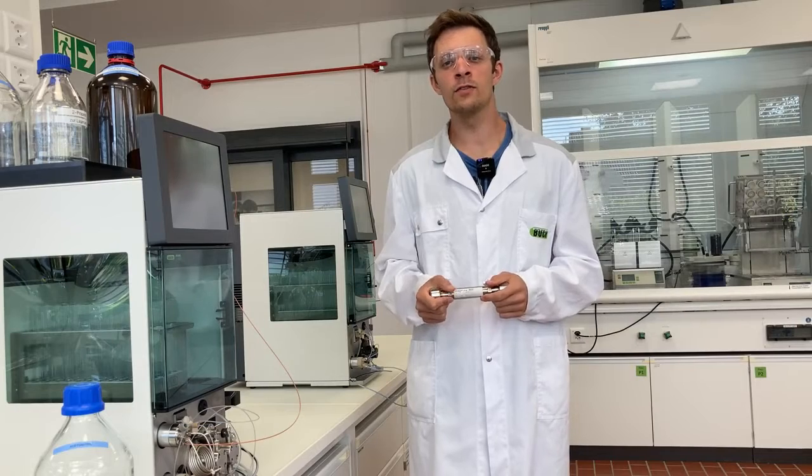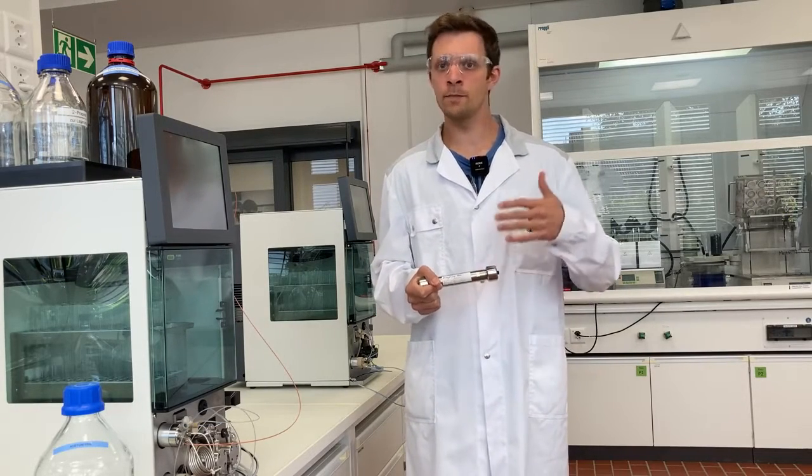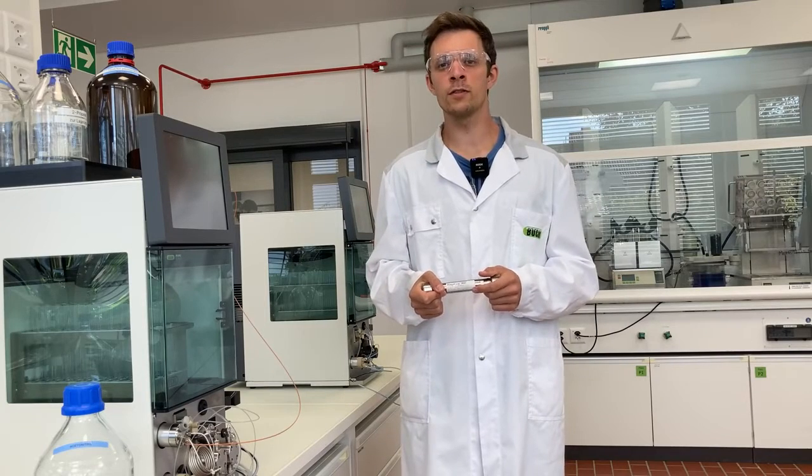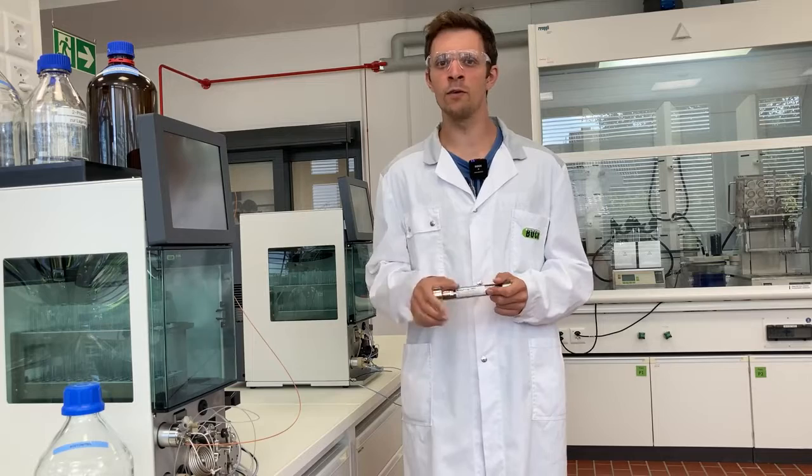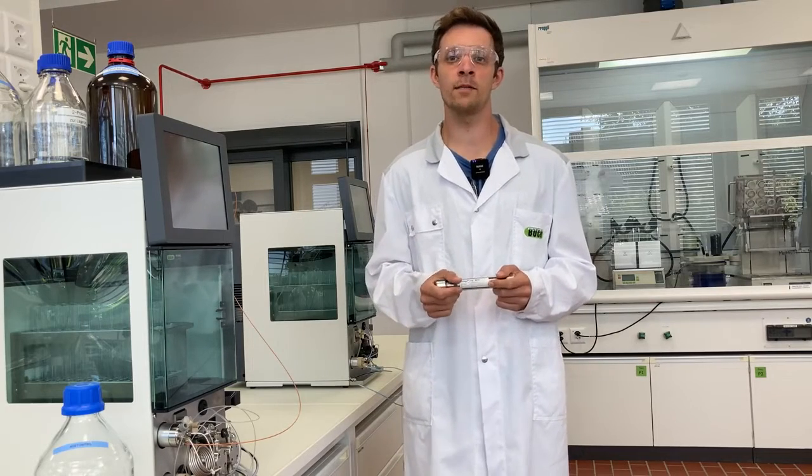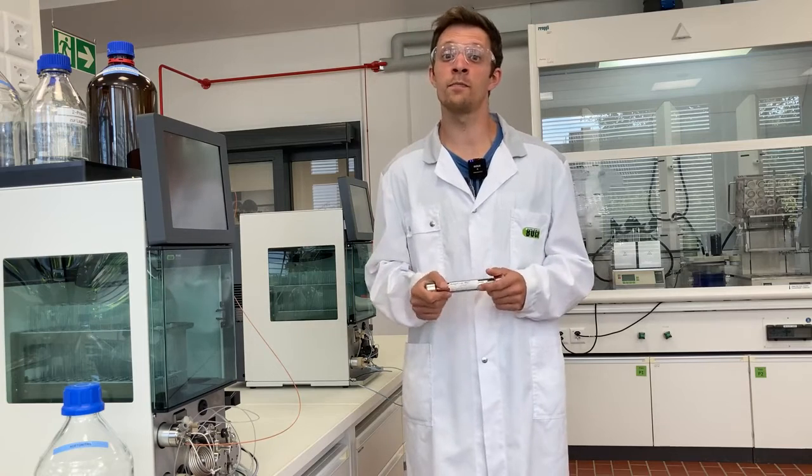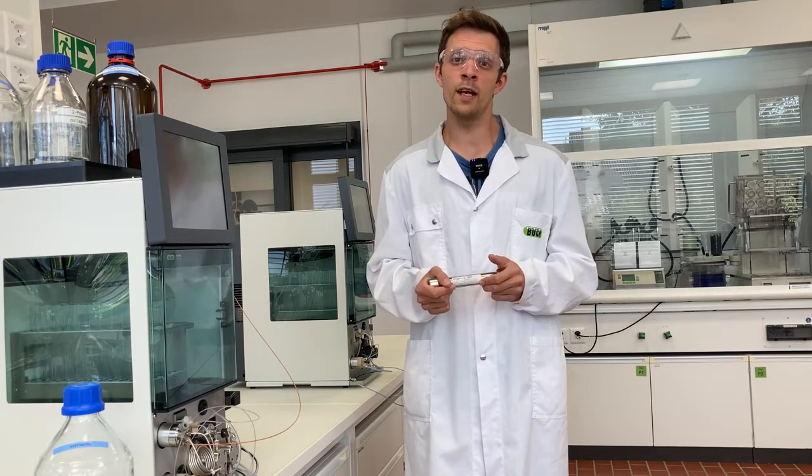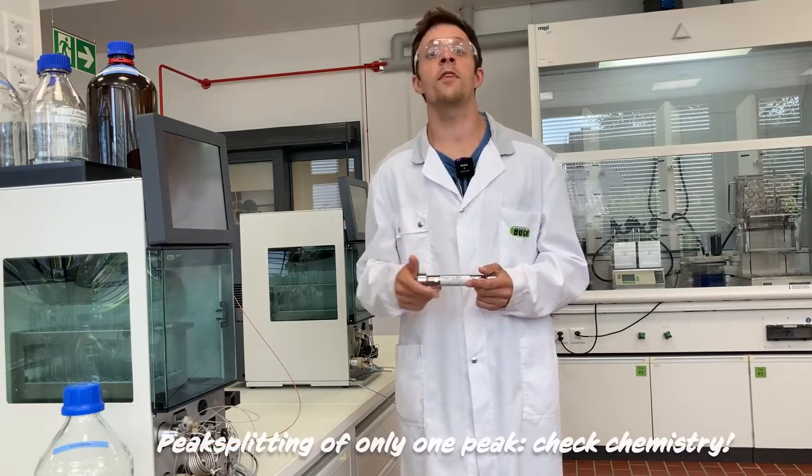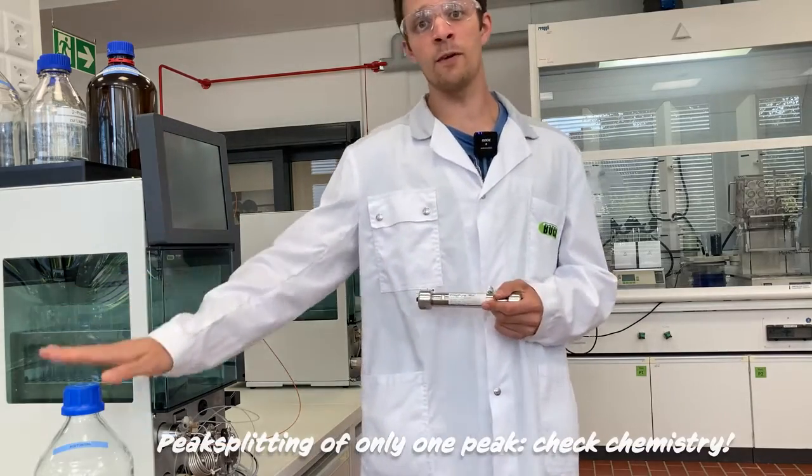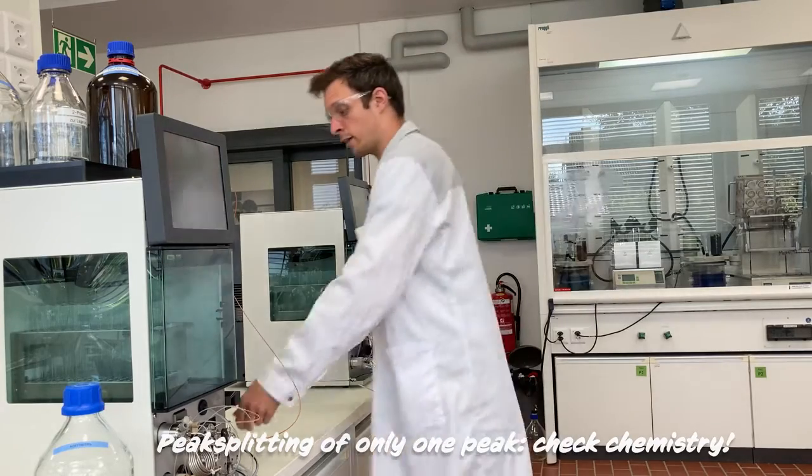Finally, I will go into more detail about peak splitting. If peak splitting occurs, it's important to check if only one peak is affected by peak splitting or if all peaks are affected. If only one peak shows peak splitting, it is most likely a problem with the chemistry. To solve that, you can change the mobile phase or use a different stationary phase.